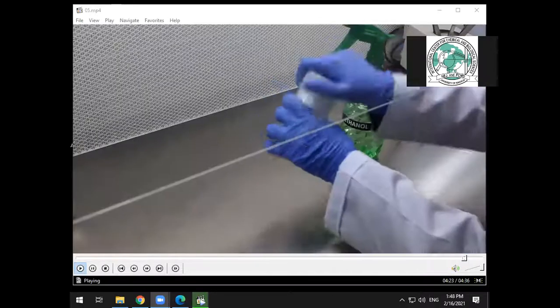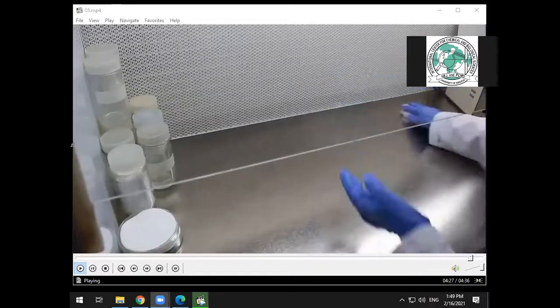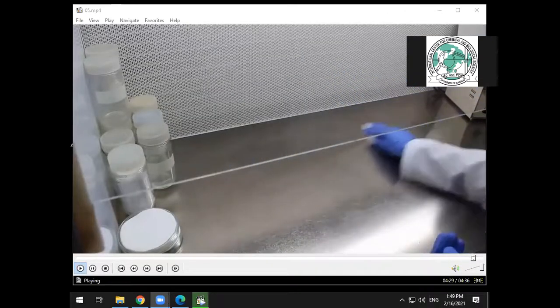After finishing your experiment, disinfect the surface of hood with 70% ethanol.